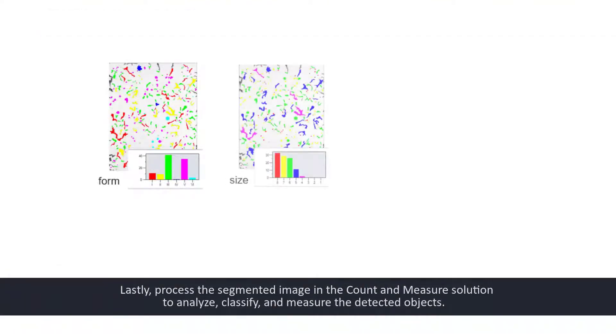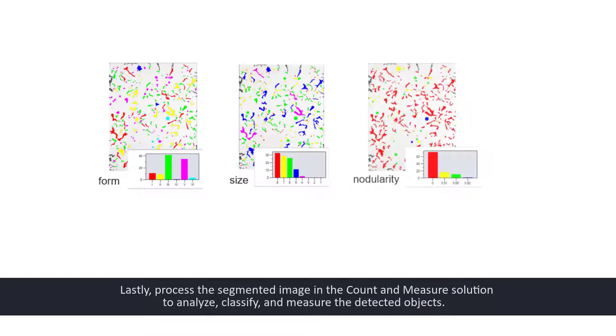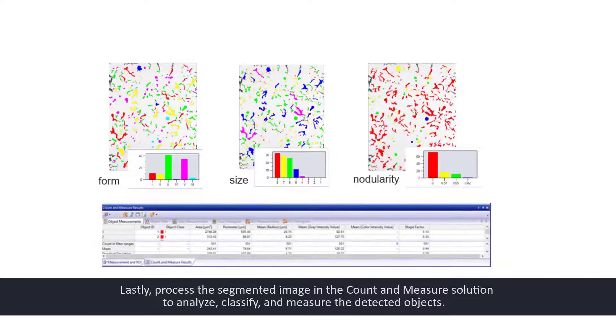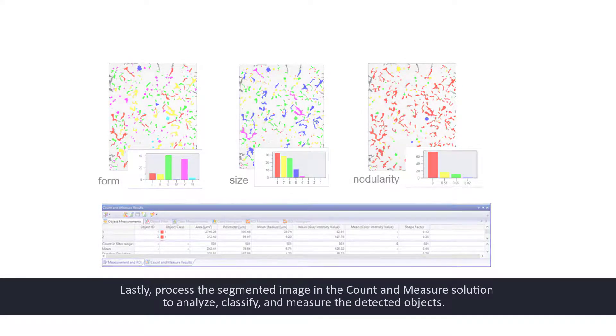Lastly, process the segmented image in the count and measure solution to analyze, classify, and measure the detected objects.